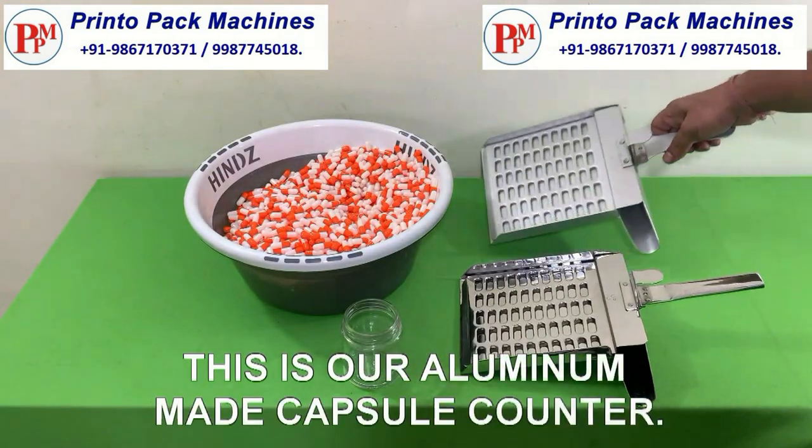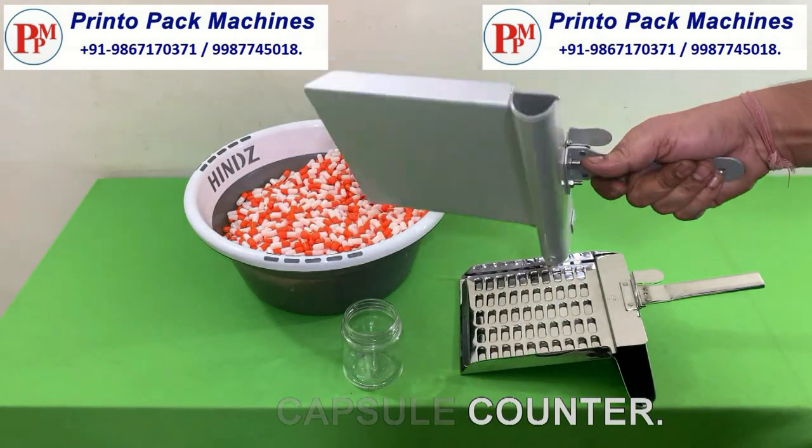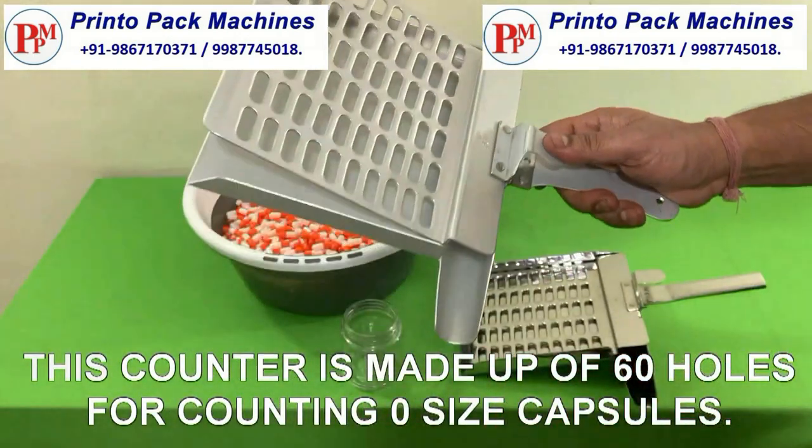This is our aluminium made capsule counter. This counter is made up of 60 holes for counting zero size capsules.